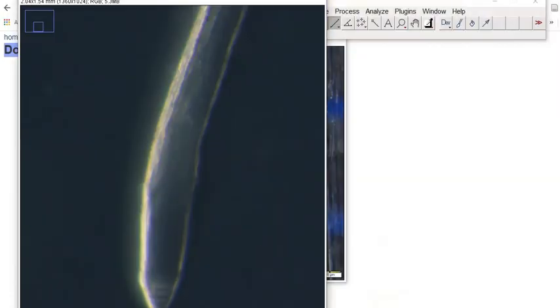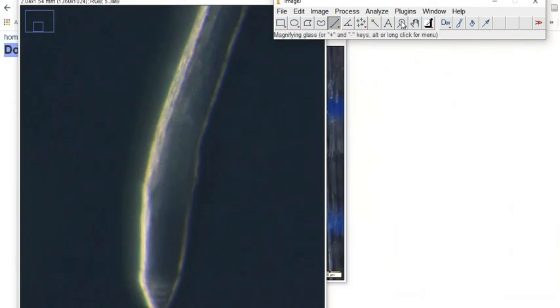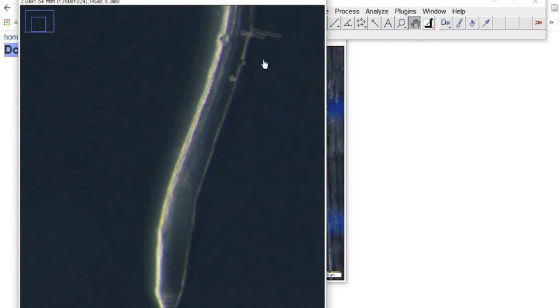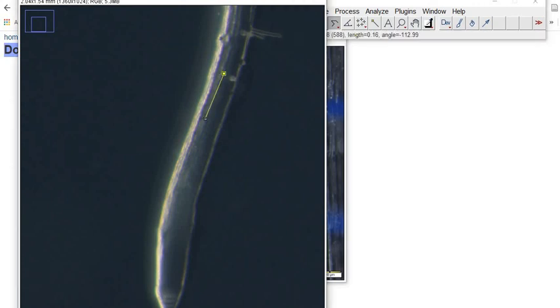And then I am going to open my window here for this root tip measurement, and zoom out using Control and left click, so I can see my root clearly, and use the hand tool to move this micrograph. Then using a line you prefer, just draw a line. I'm going to use the segmented line for this purpose. It seems this is the place where the first root hair appears, so I'm going to draw a line.